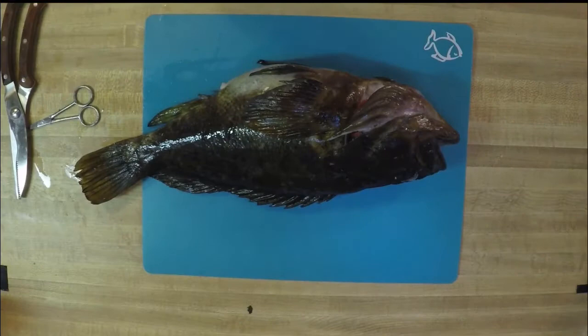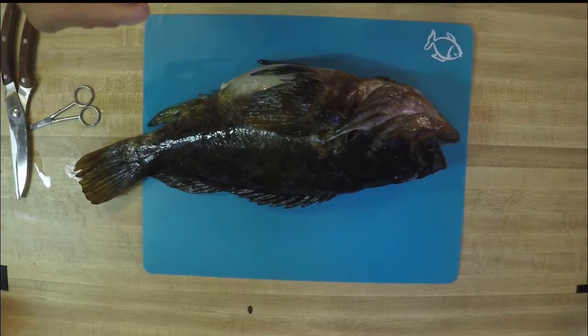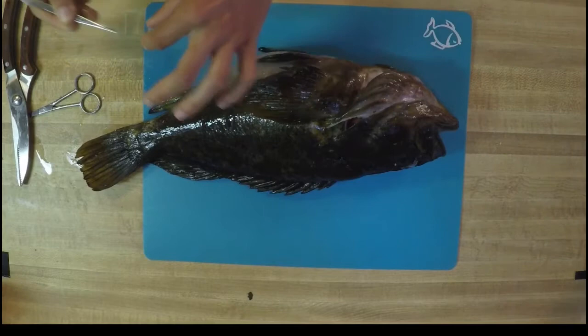Your third type of scales are going to be called cycloid scales — they're a pretty round scale, oftentimes found on reef fish. And our fourth type are called ctenoid scales. Ctenoid scales are pretty similar to the cycloid scales, but they also have little teeth on their overlapping edge. So what we're going to do is pull off one or many scales of our fish right on the table in front of us. I'm going to use my tweezers, wedge them underneath one of the scales and pull it out. As we can see, this scale has some teeth on the edge, so I'm going to determine that this is a ctenoid scale on the rockfish.